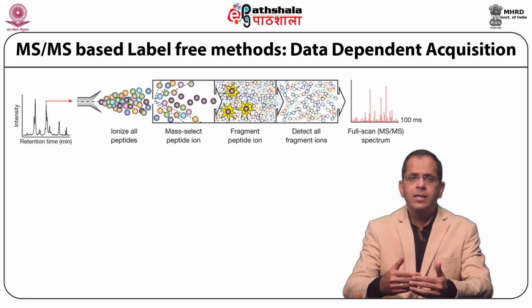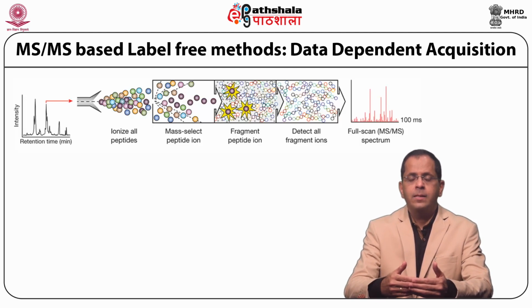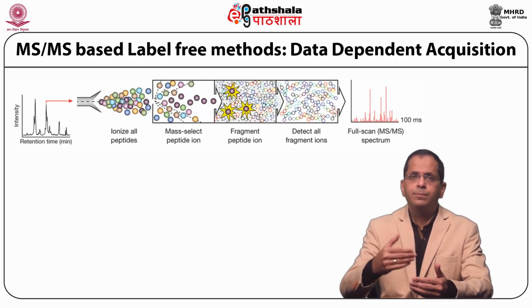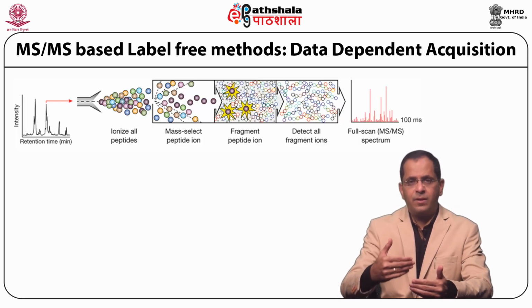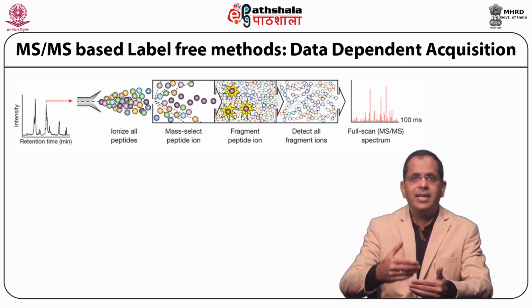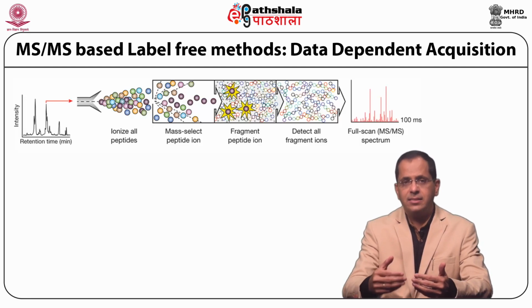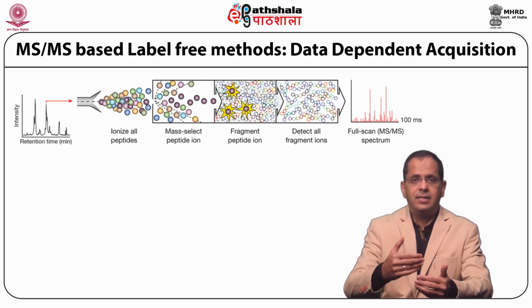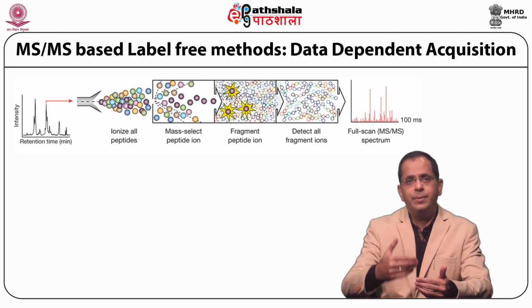In the technique, for two samples that need to be compared quantitatively, liquid chromatography associated MS-MS experiment is performed for both the samples separately, and precursor ions, mass to charge, and the retention time (RT) file for all the MS-MS spectra of each identified protein is created. Depending on the mass spectrometric acquisition mode, two analytical methods, that is data dependent analysis and data independent analysis, could be carried out.